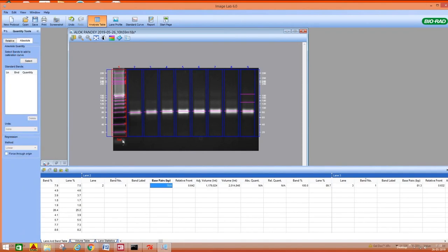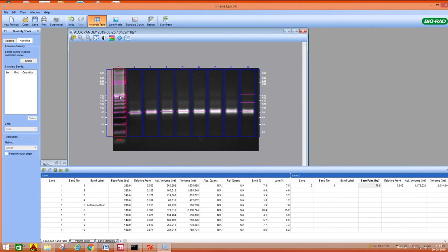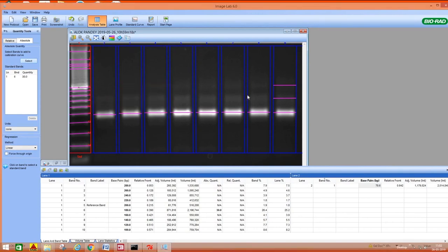And the other part is quantity tools. You can quantify the DNA also. So here also same as in case of protein analysis. Relative, so you have to select one band. Suppose I'm selecting this one. Based on this, it will calculate all bands relative intensity, relative quantity. Or you can select a standard band, and this is quantity. This band quantity, I'm saying it is 30 nanogram.